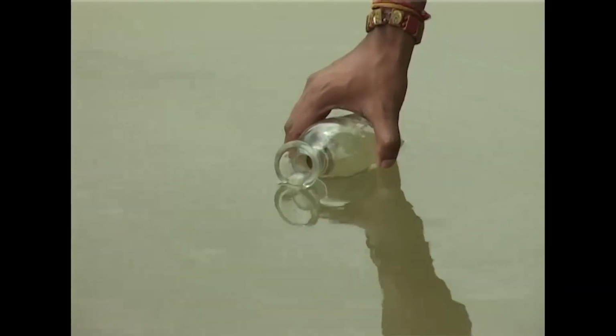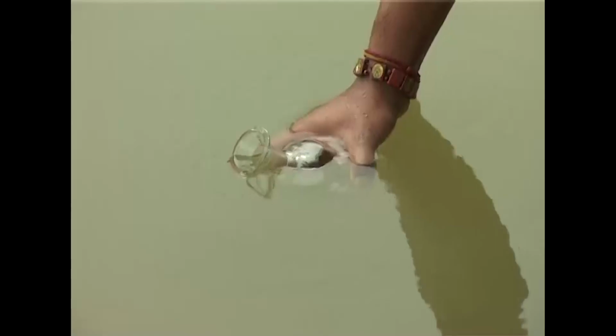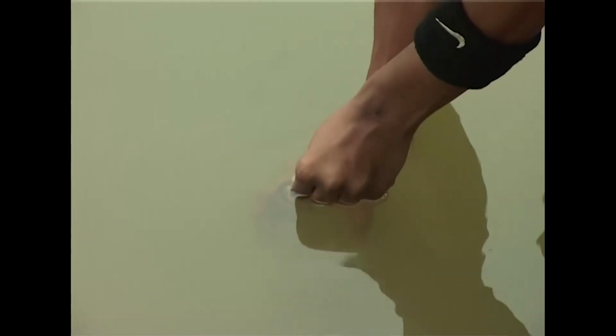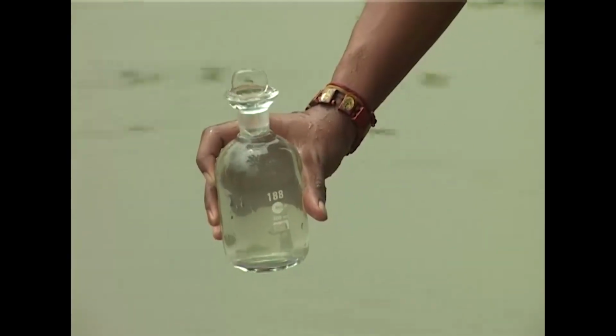Here you can see in this picture that the BOD bottle where you are going to collect the water has to be immersed inside. That means the capping of the bottle after collection of water should be done in such a way that the oxygen from the external environment should not get into the BOD bottle, and therefore the BOD bottle is immersed inside the water and you place the cap over the BOD bottle inside the water only. Therefore, you are going to determine the amount of dissolved oxygen that is present in water and not the oxygen which is coming from the external environment.